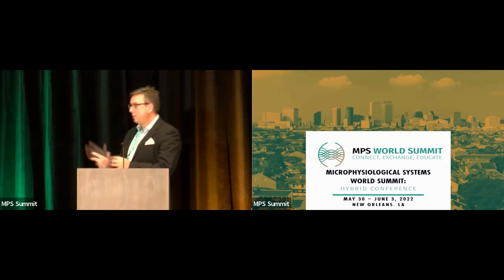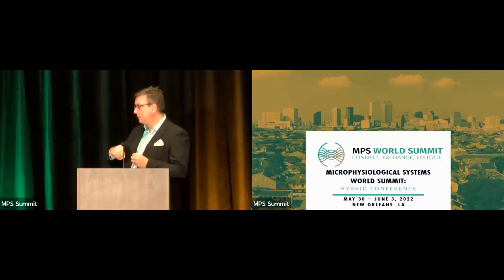Yeah. So the work that we do here is under static conditions in the 384 well system, right? So we have no flow because again, this is a screening setup, but point is well taken. We also have the Acura flow system where we are lining up tissues.